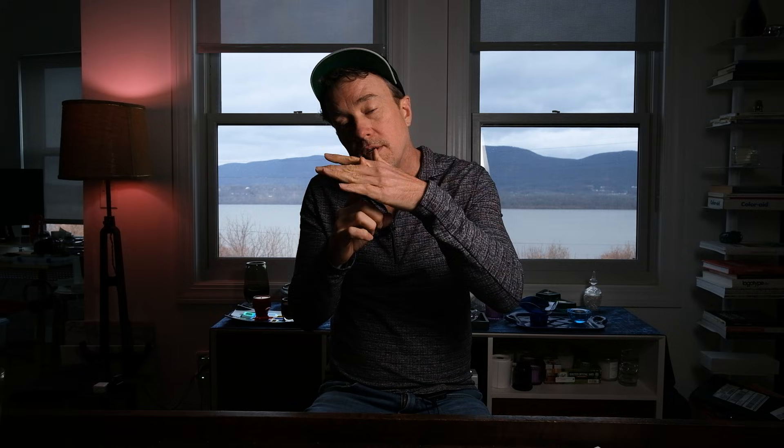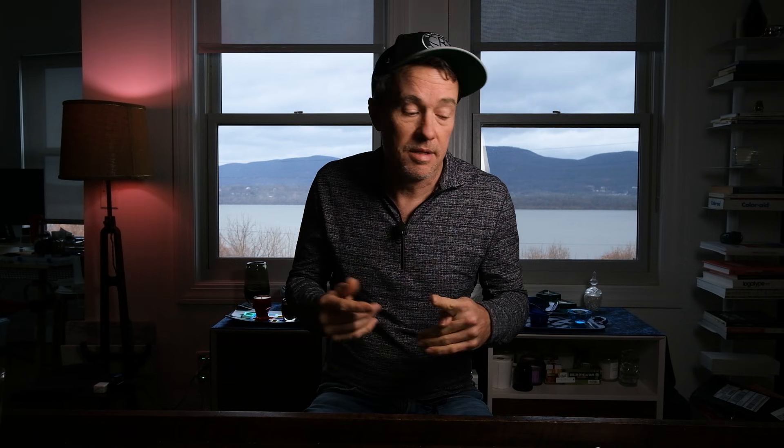The second method is called the trap door method. Just like the name implies, we're going to cut a flap in our agar — a door — then take a contaminated sample and put it right underneath that flap, sandwiching the mycelium in. The mycelium will then grow straight through the agar where you can snag a clean sample off without any bacteria. Pretty genius — mycelium is pretty resilient; it's crazy how this stuff grows.